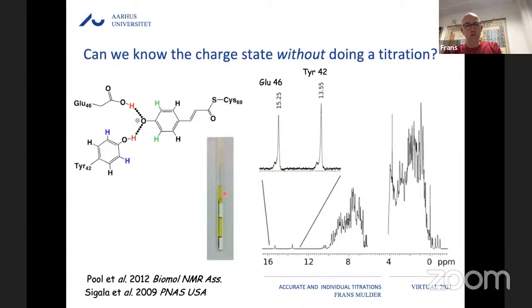Here is our NMR tube with the protein. It's nice and yellow. Dan Herschlag's lab has also done very nice work, reconstituting the protein with different forms of the chromophore, in a similar manner to what was presented by Professor Boxer a few weeks ago.